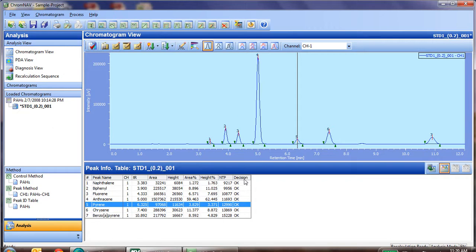Now, within a report, of course, in the peak info table section, if you're using the system suitability, you want to add this decision to this table so that you see it on each printout. Otherwise, that concludes the system suitability.